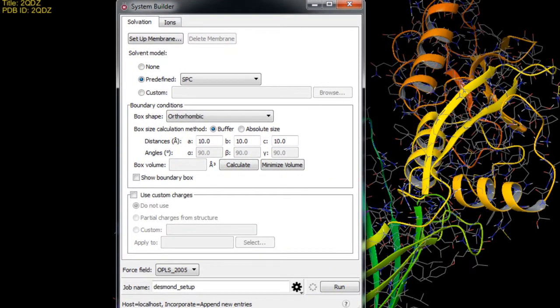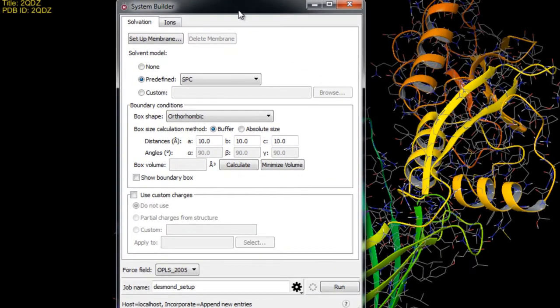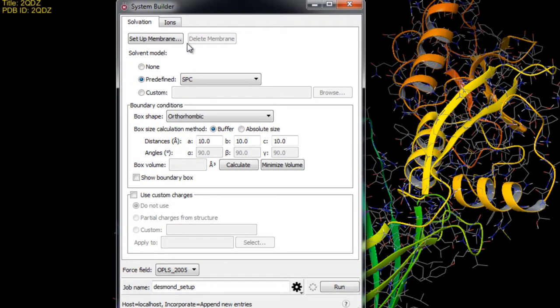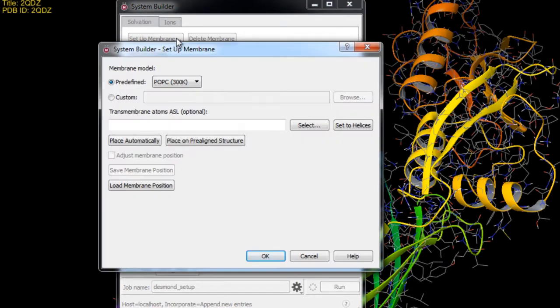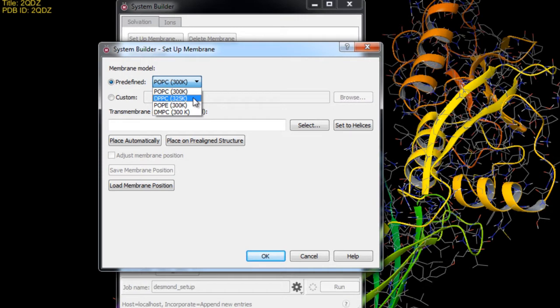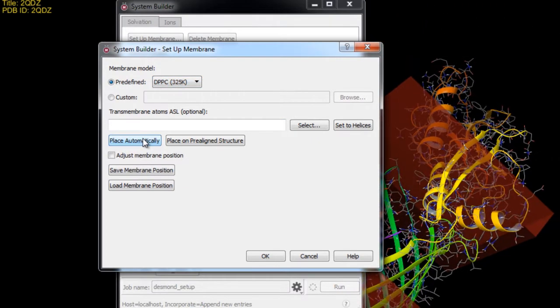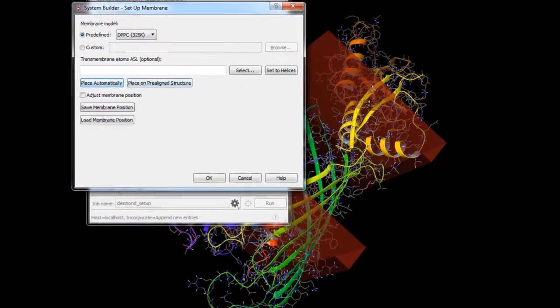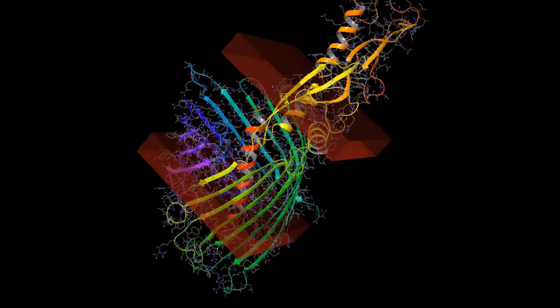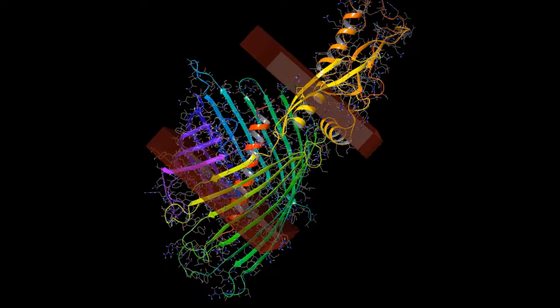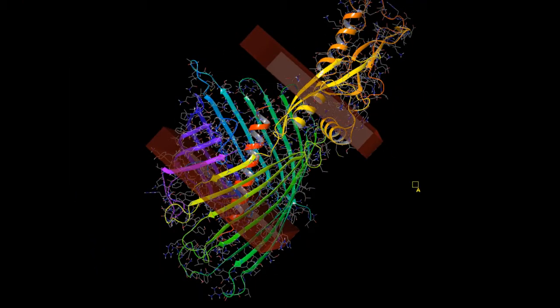Once open we'll set up the membrane first so click setup membrane. Now in this example we'll choose the DPPC phospholipid from one of the predefined membranes. Note the various temperatures at which the membrane patches were pre-equilibrated at. Next we'll attempt to place the membrane automatically. You'll notice that the membrane wasn't placed correctly. This is because the default placement takes into account the alpha helices rather than the beta barrel.